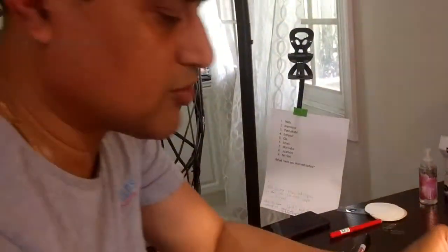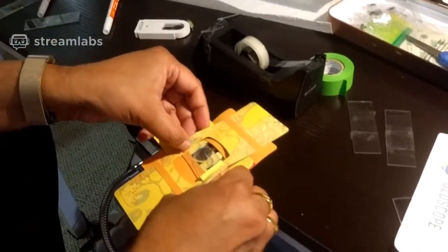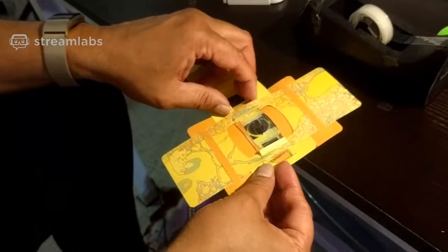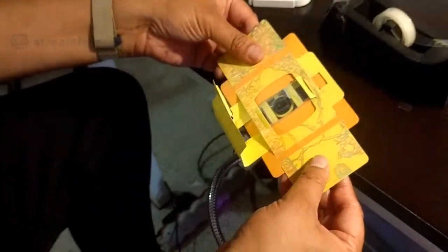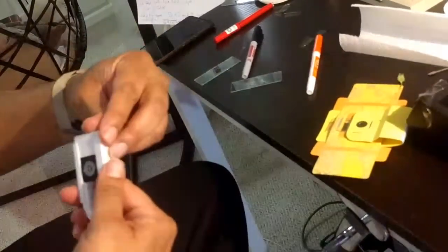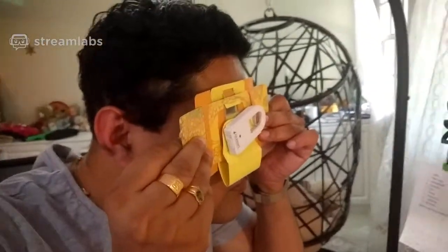You all know how to use a Foldscope. So we shall put that in. Sometimes it can be a little bit of a struggle, but make sure that you have your sample there, and then the light module. Turn it on. Take a look.